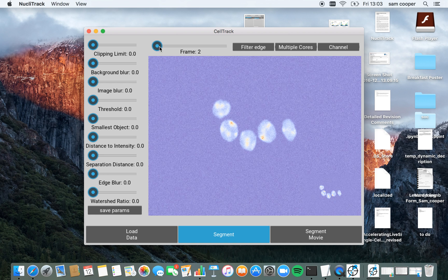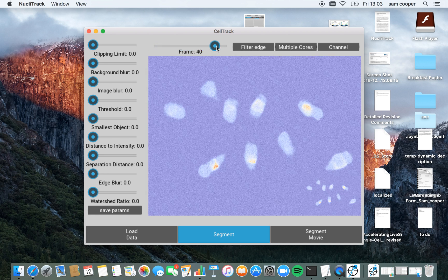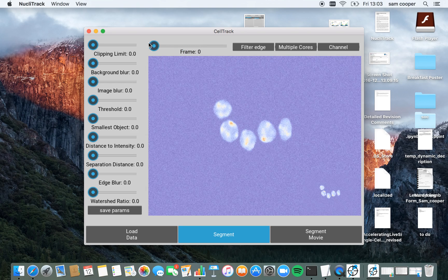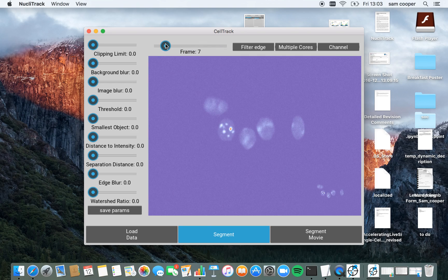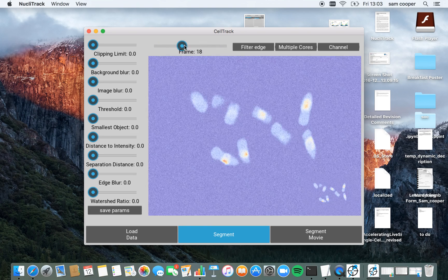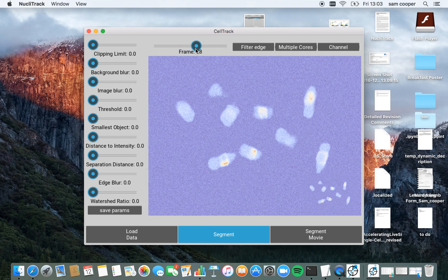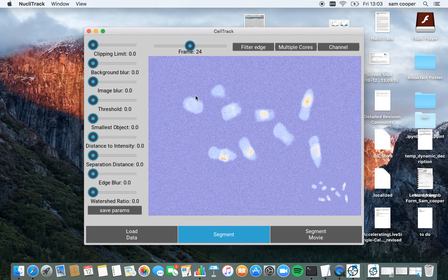I can scroll through the video to see what's going on here. I'm going to choose a good frame now to start segmentation. I'm going to go for this one because here there's lots of nuclei with different things going on.